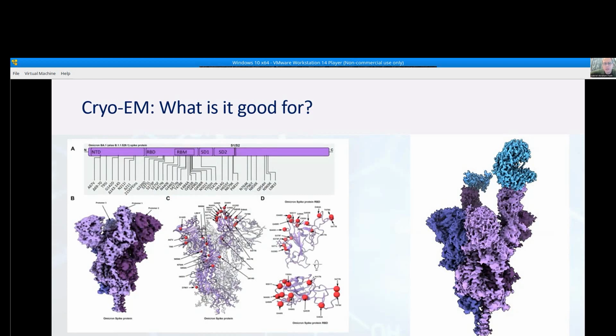However, this technique requires dramatically more extensive work in preparing samples and putting them under conditions where it can often be disputed whether the final structure is actually representative of reality. What I will show here is that cryo-EM in principle can bring structures that we are very sure represent reality. However, sometimes we have questions whether the structure itself is correct. In other words, the chemistry and the biochemistry are kept, but the way that we deduce the structure sometimes has to be scrutinized. And I'll try to explain why.